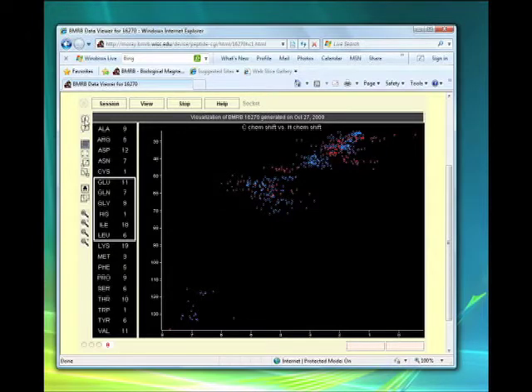Now I'm going to cover the toolbar, which is an important part of the JavaScreen user interface. So far I've done everything in the default toolbar mode, but a number of other modes are useful in exploring visualizations. I'll start off with Cursor Expand mode, which expands the cursor to fill the entire view when you click anywhere in the view. You can see that all of the symbols in the main view are highlighted once the cursor fills its view.